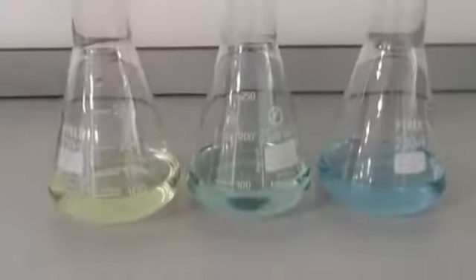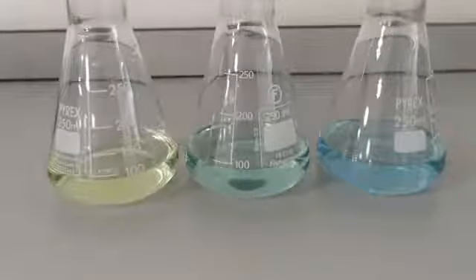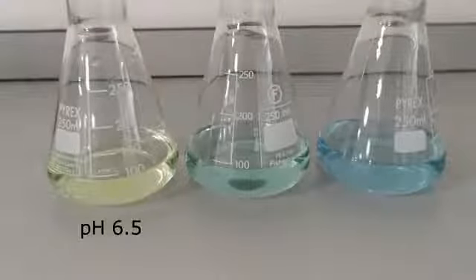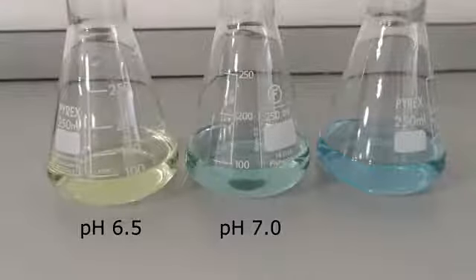For reference, these conical flasks show different stages of the endpoint. On the left, we see pH 6.5. As you can see, it's a more yellow colour still. In the middle, we have pH 7, which would be the perfect point to stop the titration. On the right, we have pH 7.5, which would indicate that you've added too much sodium hydroxide to the solution.